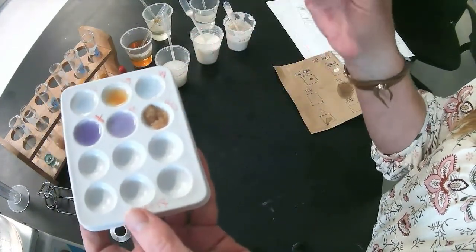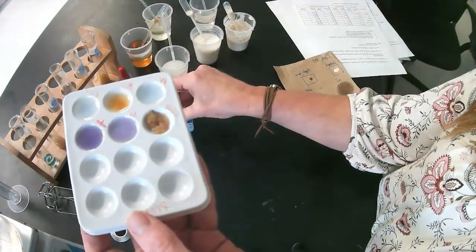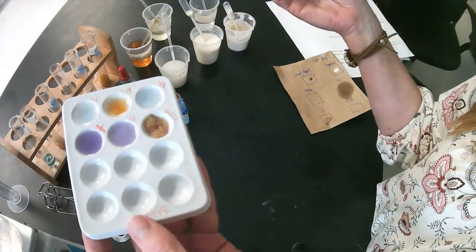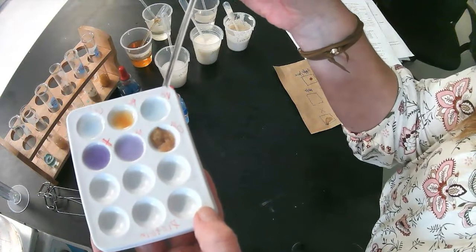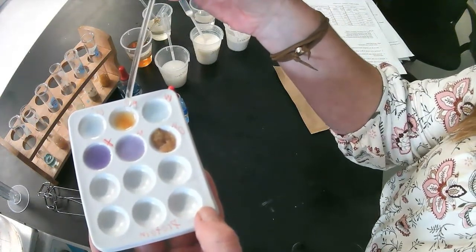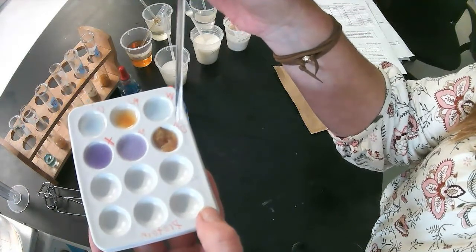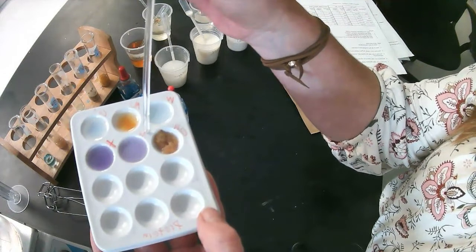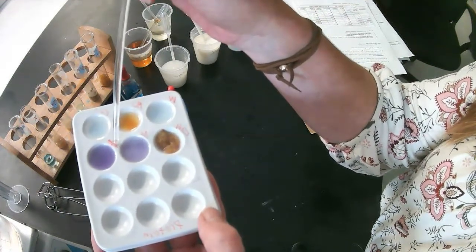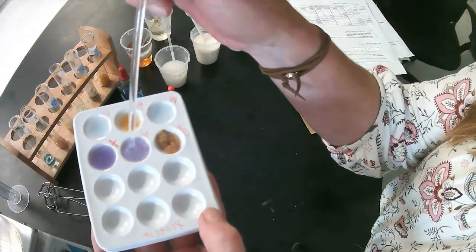So what came up positive? The biuret starts out bright blue. If it's a positive test, or if the substance has protein in it, the substance and the biuret will turn bright purple. So water, negative. Apple juice, negative. Oil, negative. Oatmeal, negative. Milk, that's positive. It's not a strong positive, but it's positive. And then our unknown X substance, very positive for protein, okay?